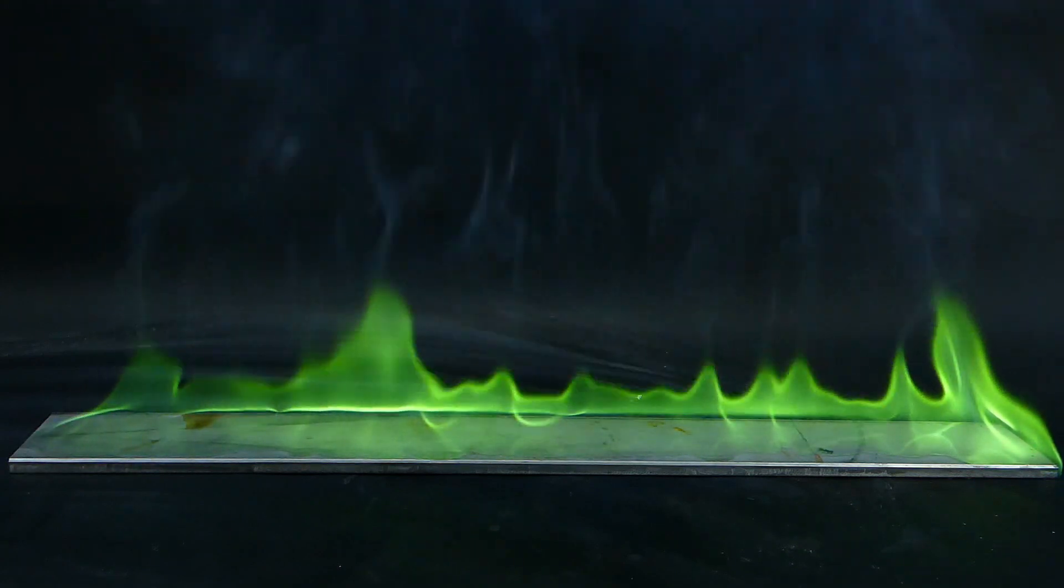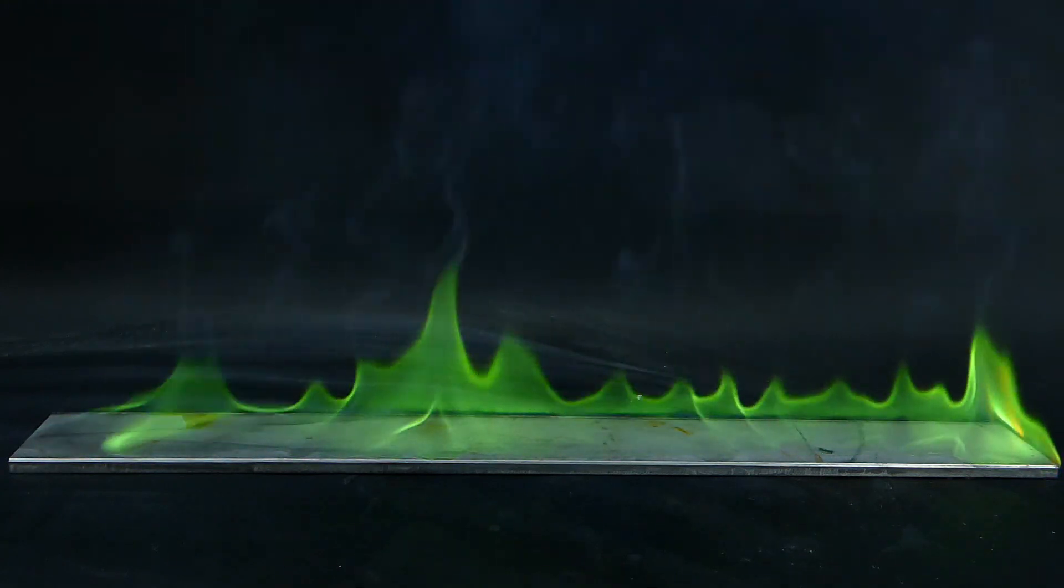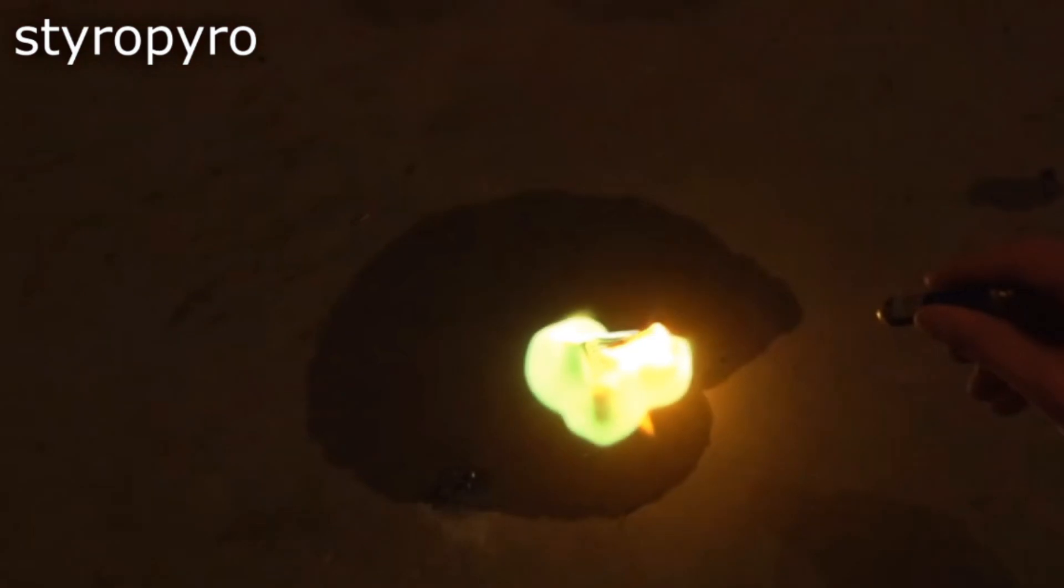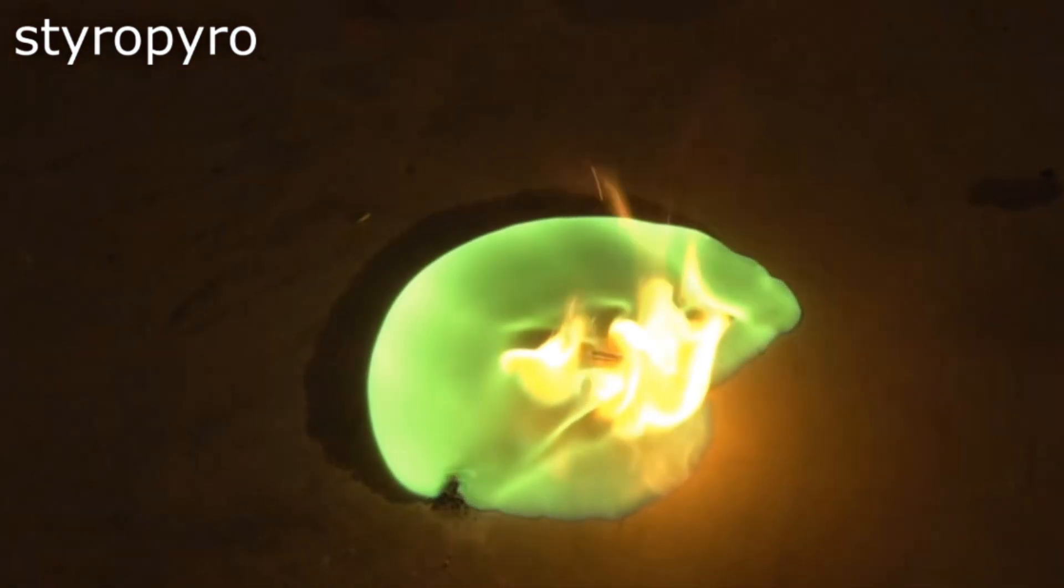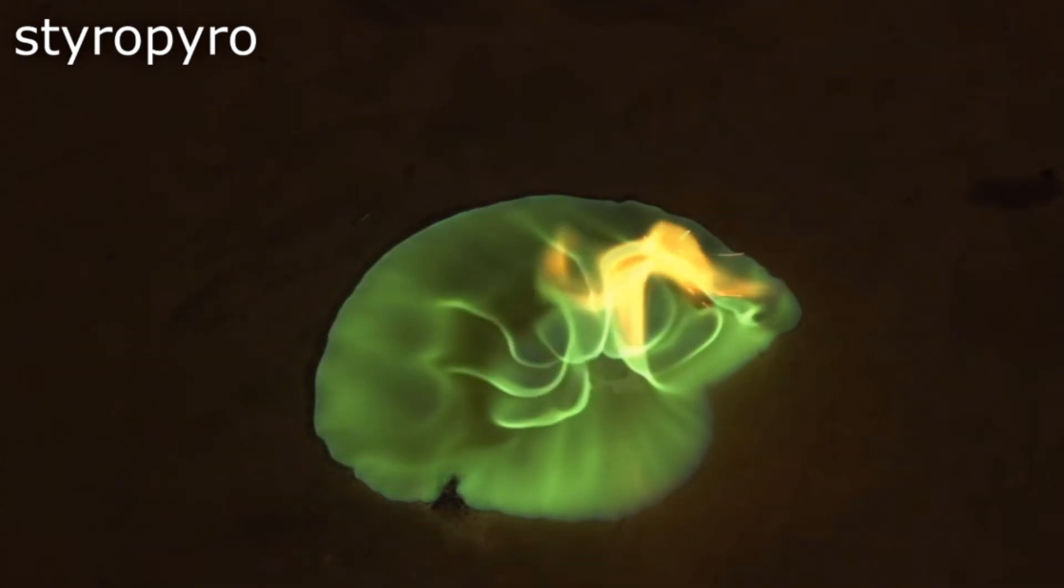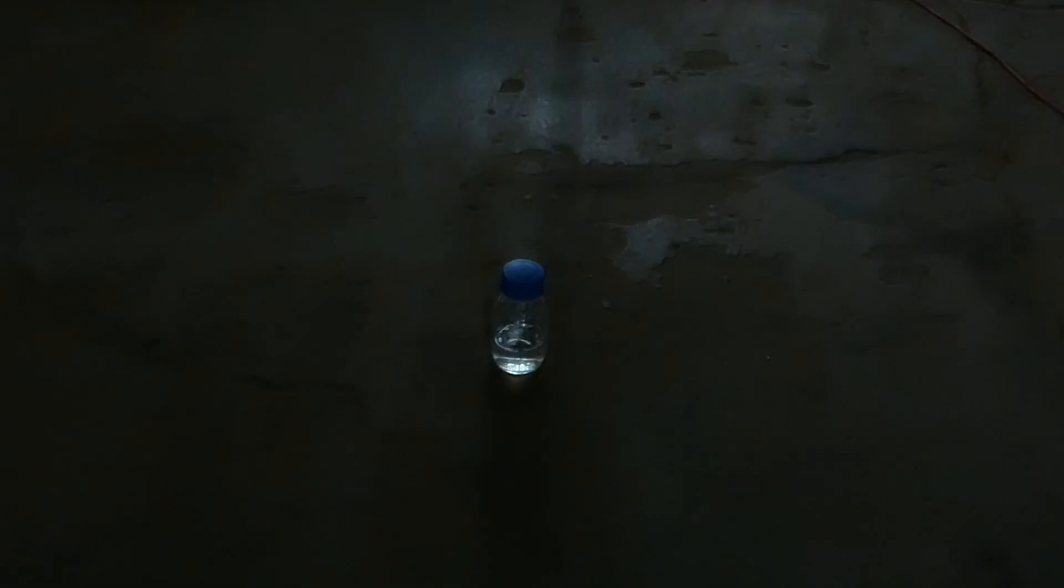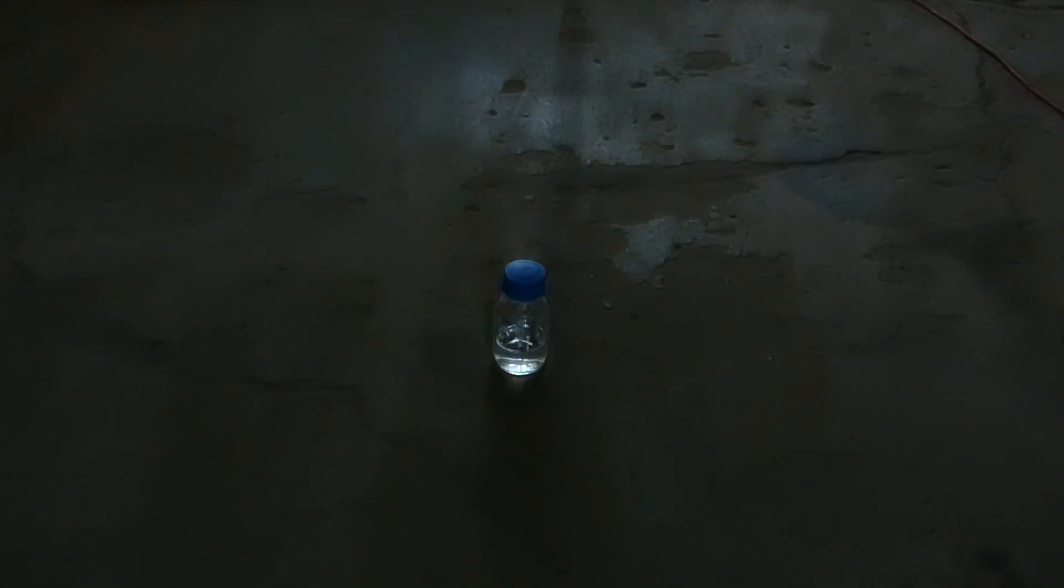As a final experiment, I decided to pay tribute to Styropyro, who is one of my favorite chemistry youtubers. He always makes this green fire on the floor, which I always found quite interesting, and now I finally was able to replicate it. To do that, I cleaned a part of my floor of any flammable debris, put on a gas mask, and proceeded to pour most of my trimethyl borate onto the floor.